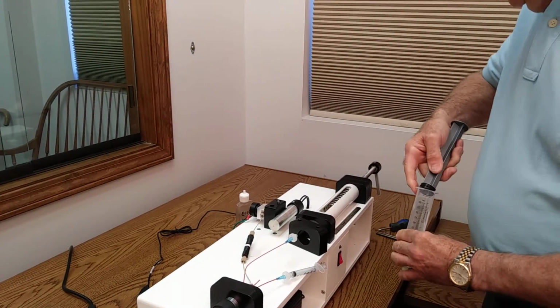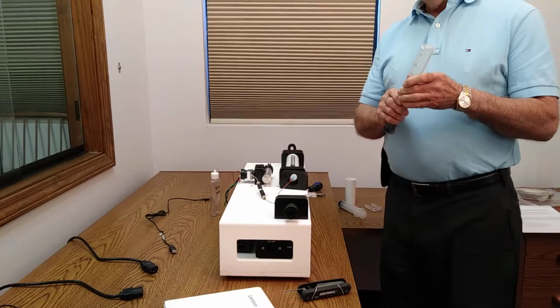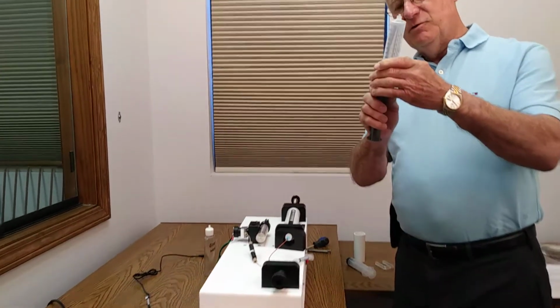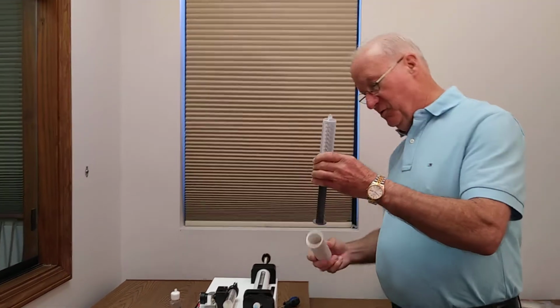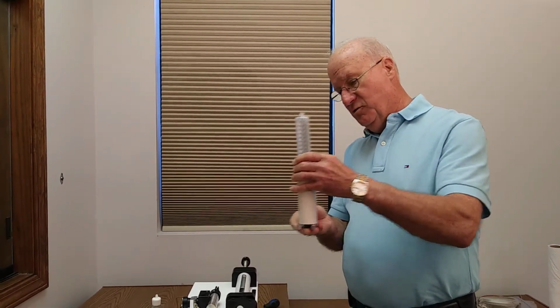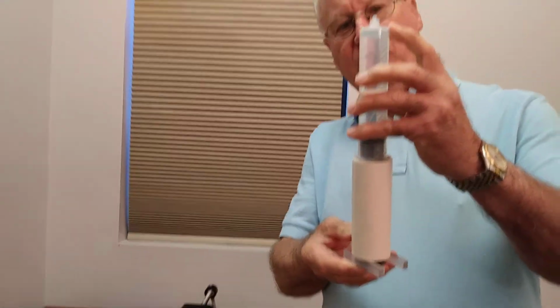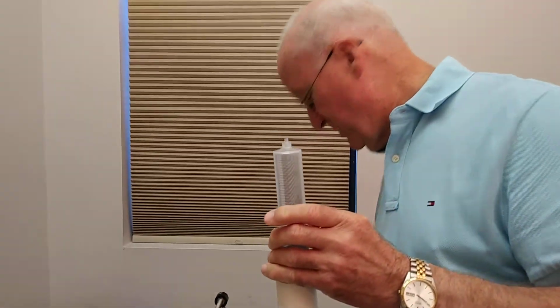So now I'm going to put the syringe in here. So now we have the syringe filled. I'm going to put this little clip down underneath here to hold the pipe. Push the air out up to the top. You have a little bit of an air space at the top.